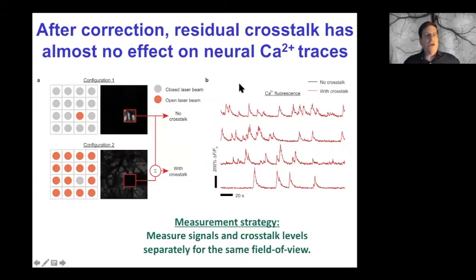Now, we were using what's called neural calcium imaging to track the spiking activity of the neurons in view. And this is a common approach in the field. One can target a calcium-sensitive fluorescent indicator to the neurons of interest, in our case, V1 cortical pyramidal cells. And a large body of work in the field has shown that the modulation of calcium concentration as reported by these fluorescent indicators gives an indirect report on the somatic spiking activity. So one can think of it as an indirect readout of neuronal action potentials.